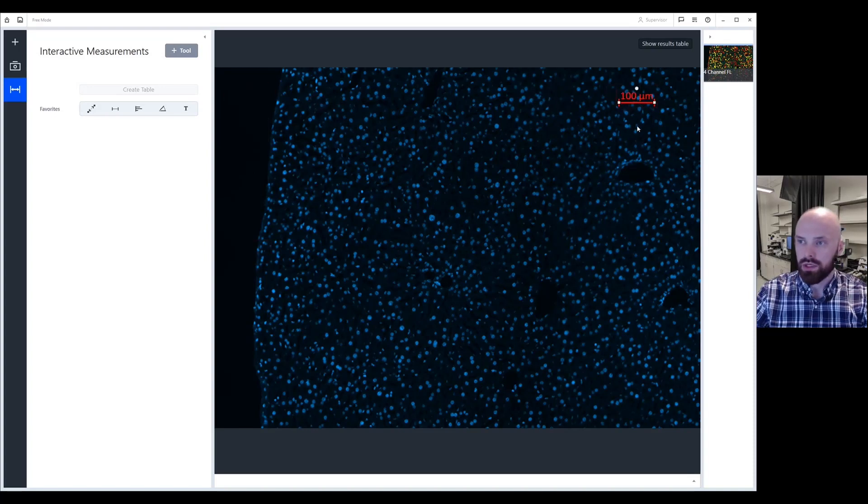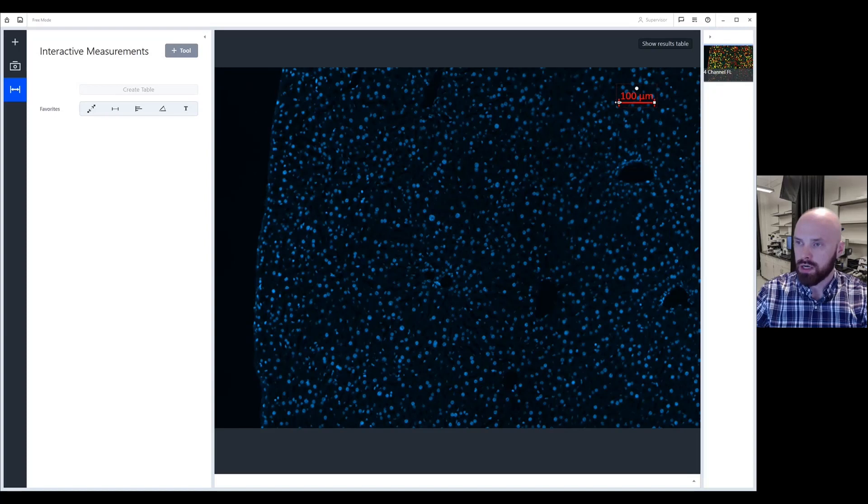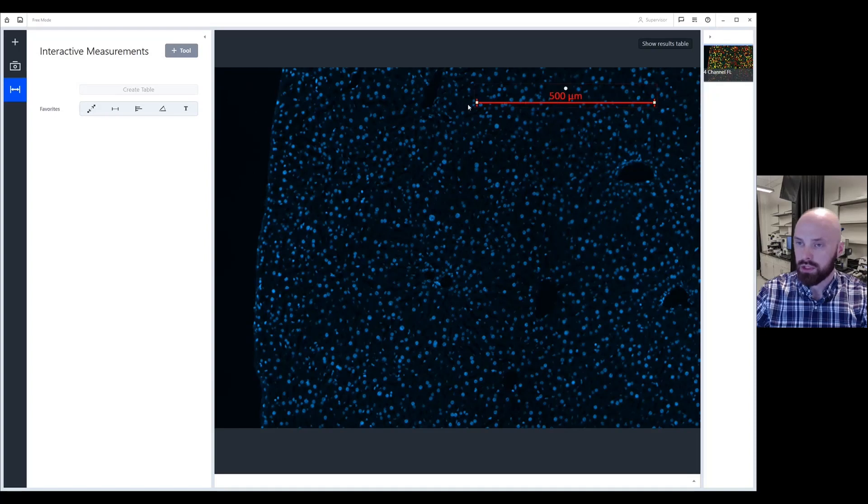When you click it, you may notice two square icons as well as a circle icon. If you hover your mouse over the square icons, what you can actually do is you can resize the scale bar. Again, I'm clicking and I'm dragging.